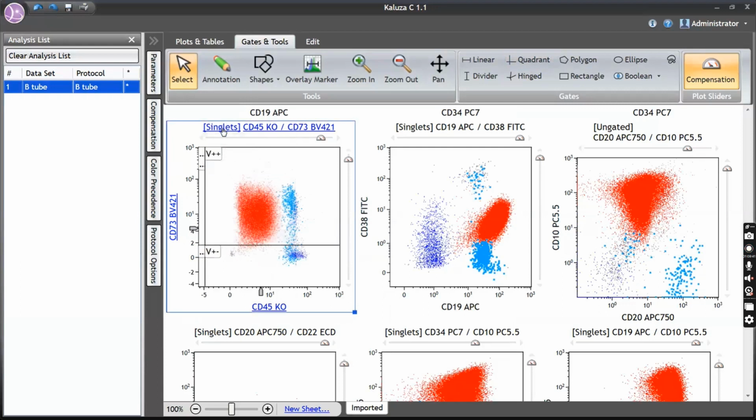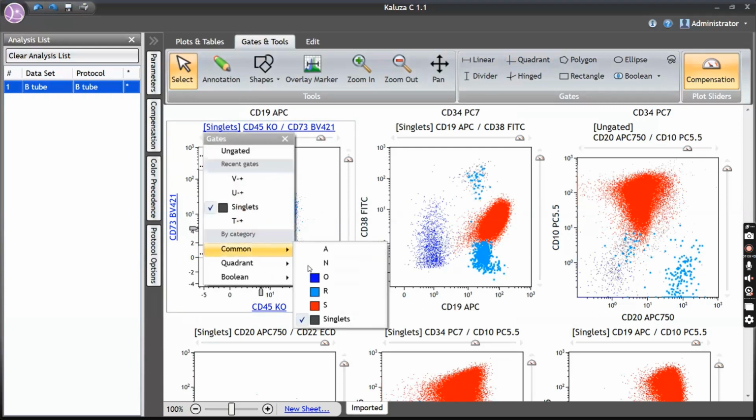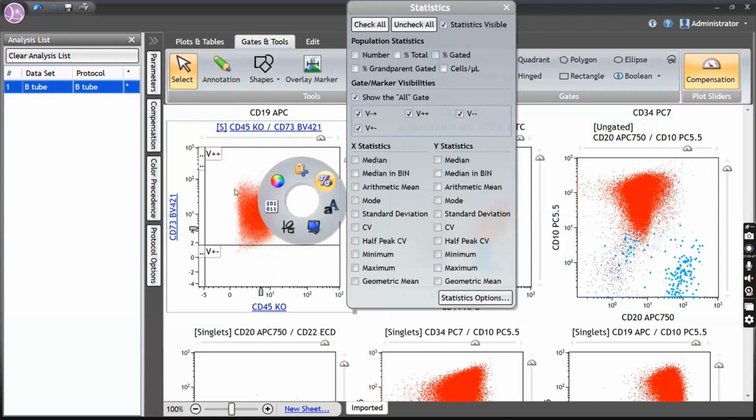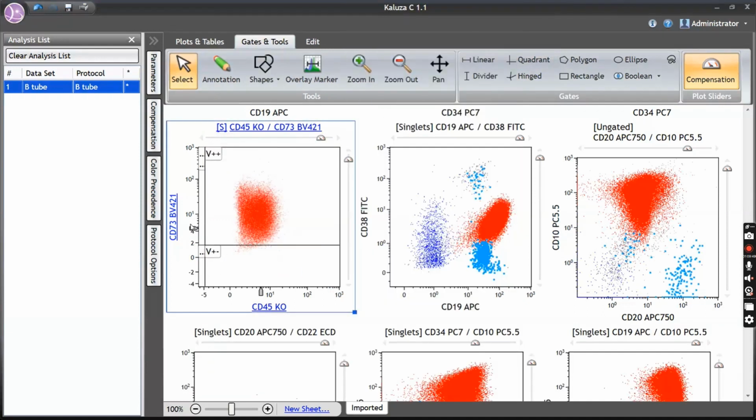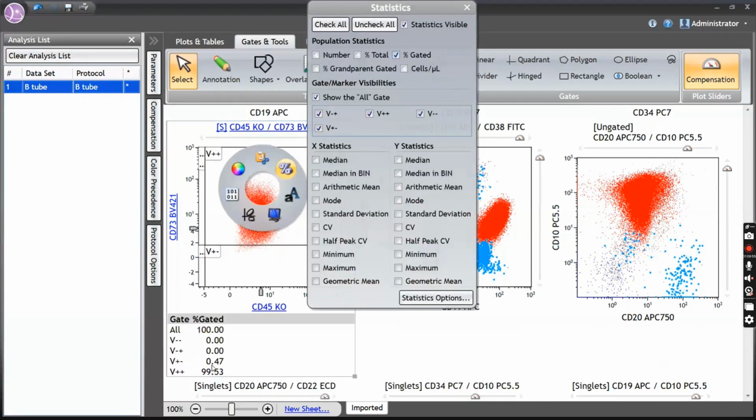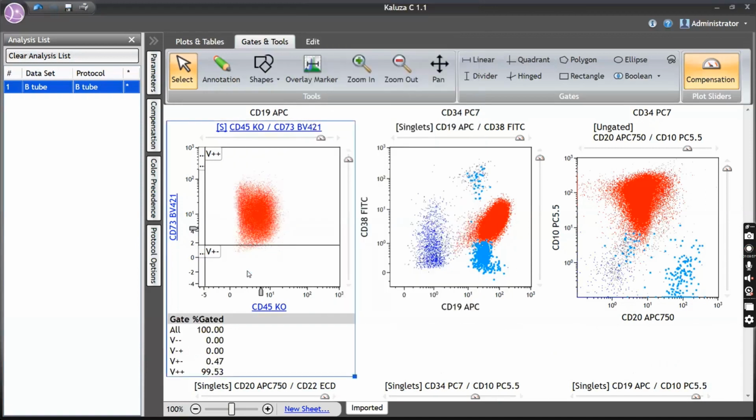Okay. So you know how to see the percentage. When you're seeing the percentage, drop only the blast and check how much of the gated population is expressing 73. The gated population here is blast, right? So it is 99.53%. 73 is overexpressed in a dim to moderate fashion. Okay, clear? Any doubts? There is one question in the chat box.